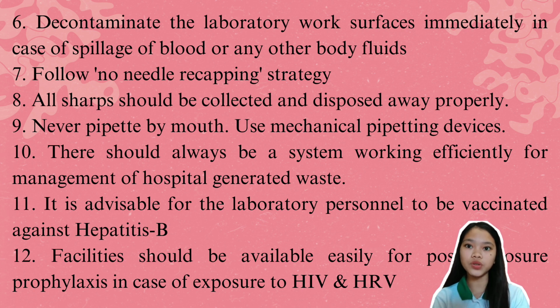Number 7. Follow no needle recapping strategy. Number 8. All sharps should be collected and disposed of properly. Next, never pipette by mouth. Use mechanical pipetting devices. Number 10. There should always be a system working efficiently for management of hospital-generated waste.